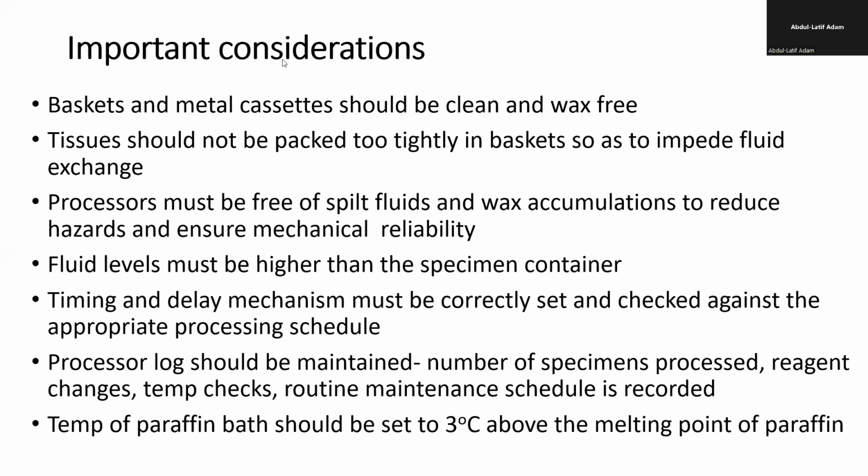Then you have to be checking the fluid levels. The tissue has to be immersed completely in the chemical that is used for the processing. You should cover it, seal it. There should even be excess fluid on it. So when the fluid level is going down, you have to top it up. When the color of the fluid is changing, you have to exchange the fluid completely. And when the volume decreases but the color is not changing, then you top it up, to be sure that the tissues are properly done.